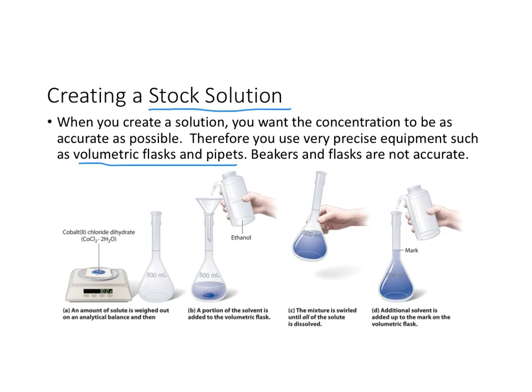flasks. Graduated cylinder is another tool that we can use in science, and graduated cylinders fall somewhere in between volumetric flasks and pipettes and beakers and flasks. They are accurate to a somewhat certainty, but not as accurate as volumetric flasks and pipettes.